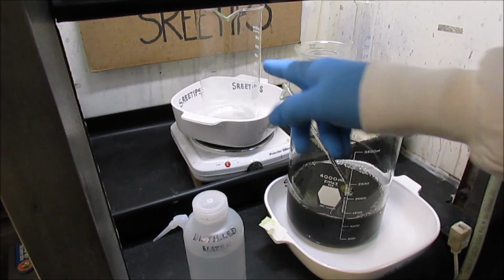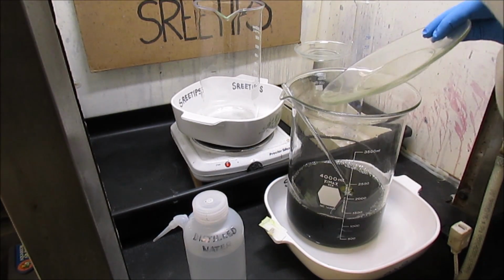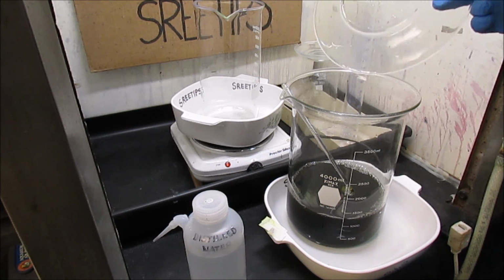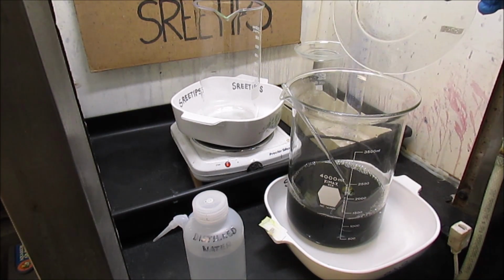Transfer the solution into a tall beaker back here, and this will help with getting the solids to settle out of that liquid, and we can get the liquid off easier if it's in a tall beaker.